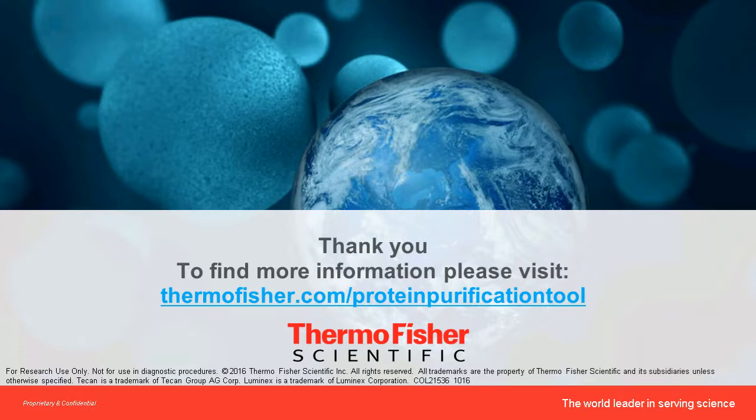Yes, so we recently spent some time validating this assay on tissue samples from both mouse and human. And for all the targets, we were able to validate them in both mouse tissue and human tissue. You may have to do a slightly different protocol for tissue sample prep, but it is compatible with tissue samples.